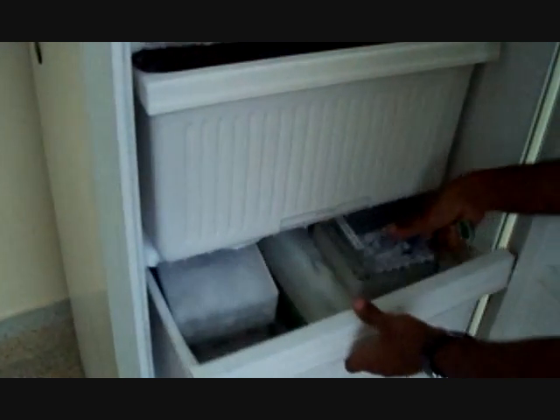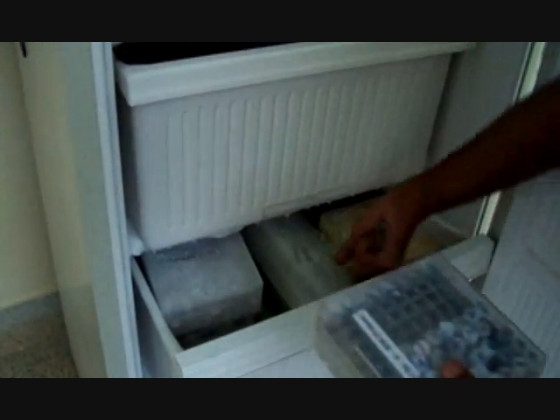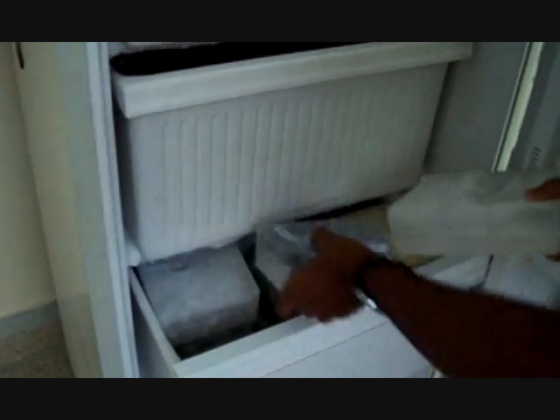Mostly, enzymes are stored at minus 30 degrees Celsius because enzymes are heat sensitive and denaturation easily takes place.